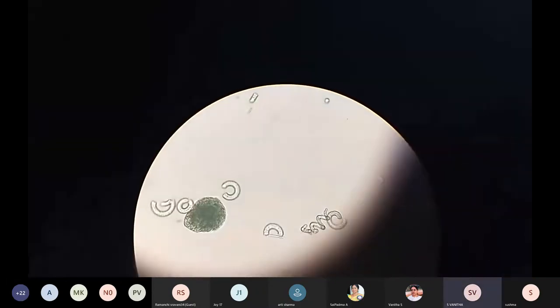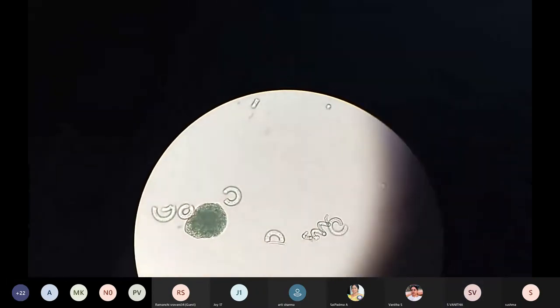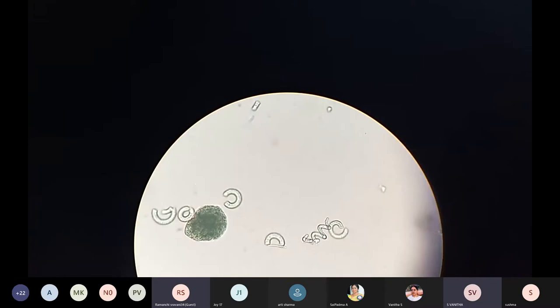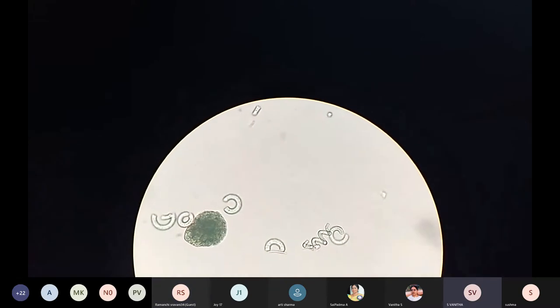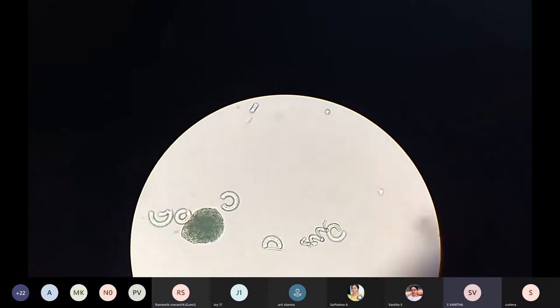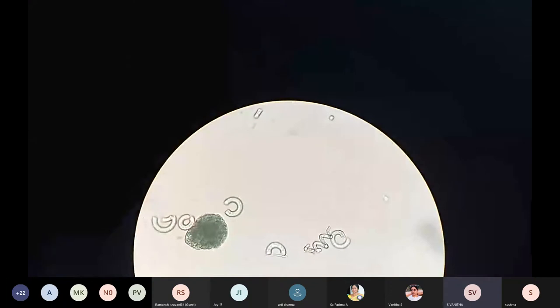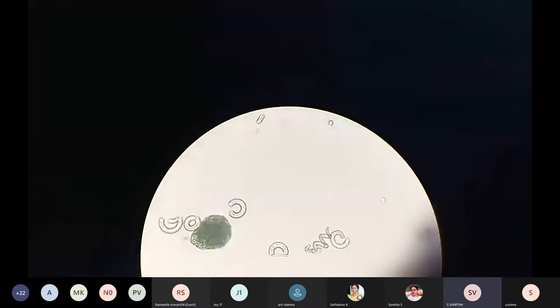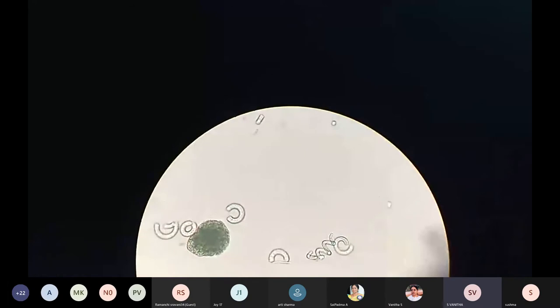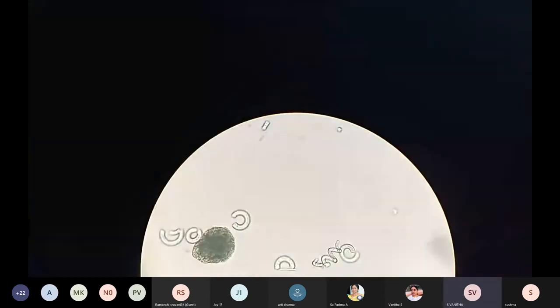You are able to identify it. Are you able to see the center spiral? Yes, it is spiraling, no? The other sample curves, what you are finding are its fragments. Broken ones. But in the center, you are able to see it. So I will try to focus it one more time. You are able to locate it, no? So the center is spiraling. That is spiraling.